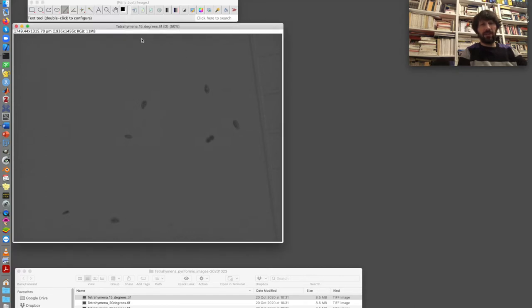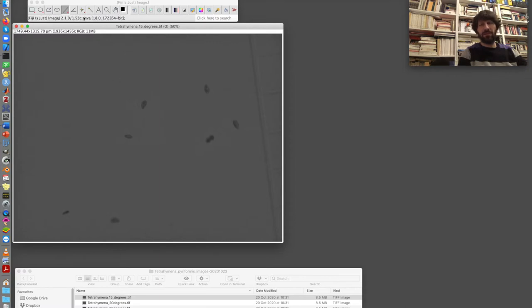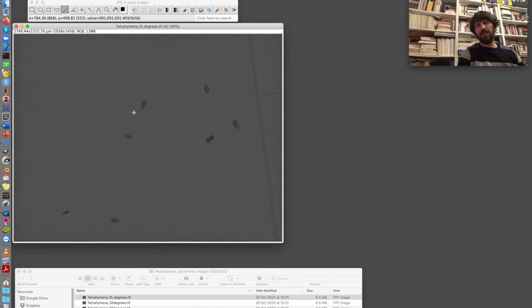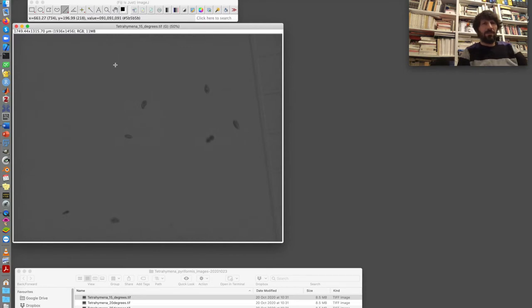And if I move my mouse pointer over the image, here in this part of the window, I will see the position of the mouse and also the value of the pixel under the mouse. I do this now. And you can see that all the three values, 91, 91, 91, which are three times the same. It means that the red, green and blue channels have exactly the same pixel value. This is why the image looks like if it was grayscale, even if in fact it is a color image.